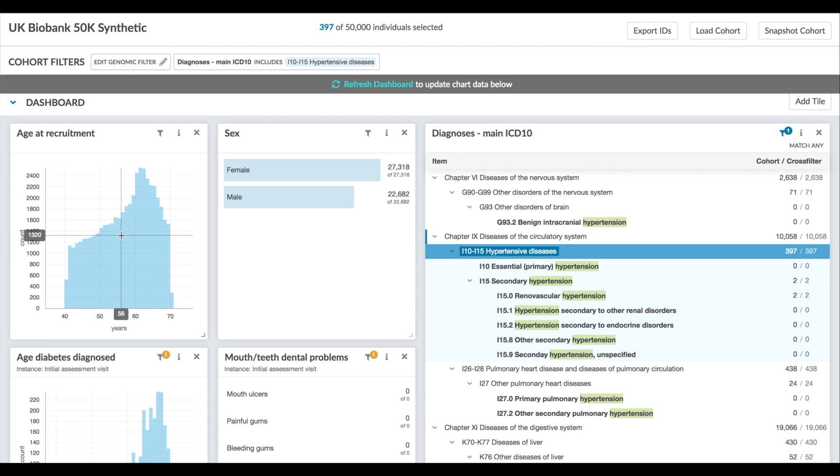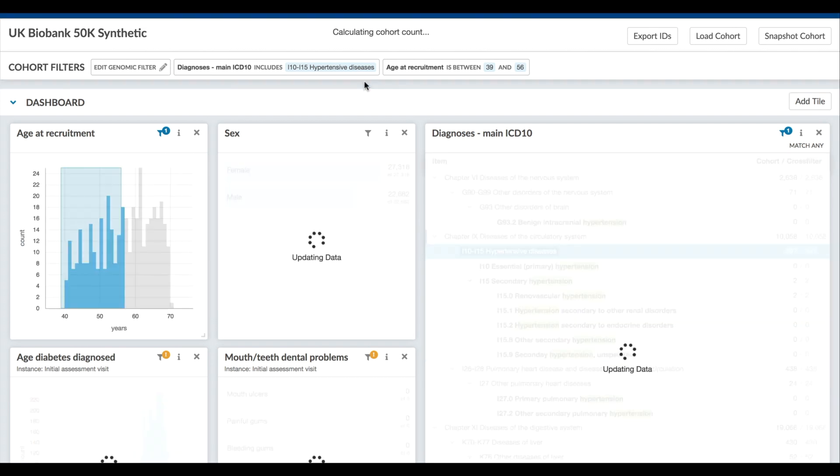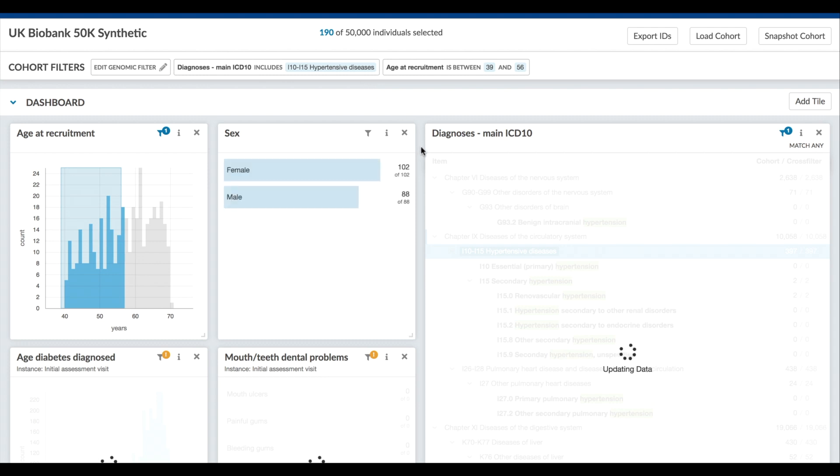I'll stack that filter with another criterion for the cohort based on age range. I've selected the younger half. Now when we apply these filters we see that the size of the cohort changes from the original 50,000 people down to 190.